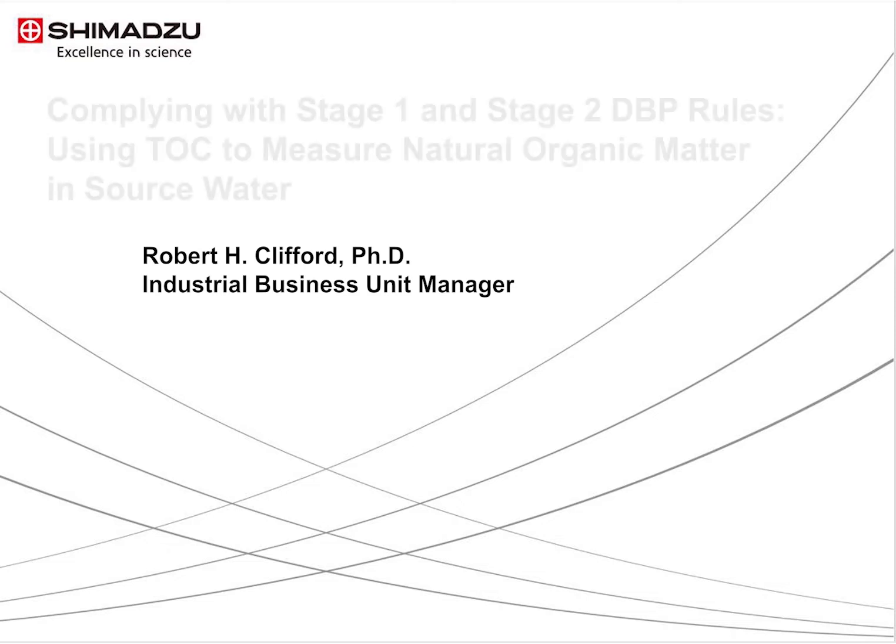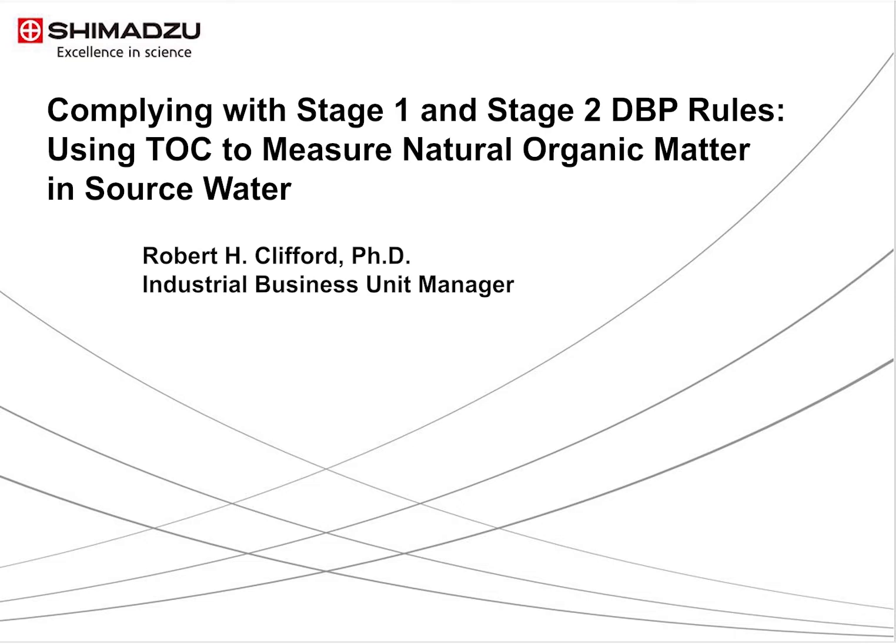Today's topic is complying with Stage 1 and Stage 2 disinfectant byproduct rules, using TOC to measure natural organic matter in source water. Also during this presentation, I will discuss trihalomethanes, THMs, and haloacetic acids, the HAA5, since they are tied so closely to the TOC parameters.